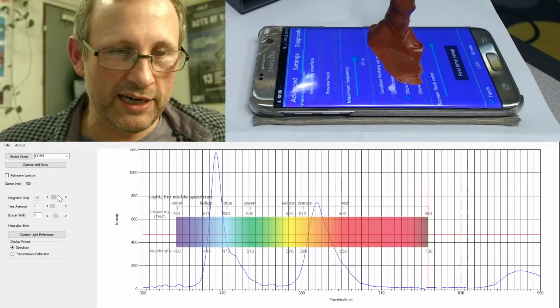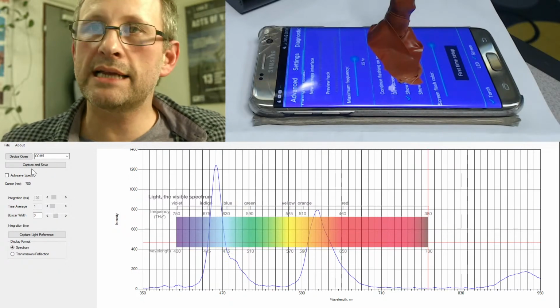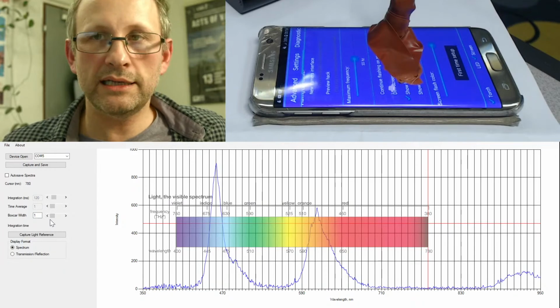And so this really is delivering what I would have hoped it to do. Is the 10 millisecond minimum sample time enough to get us what we want? I think it may be.